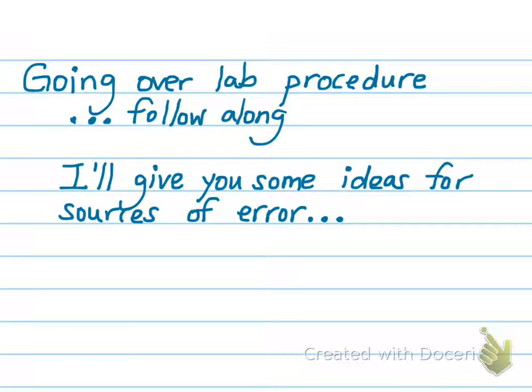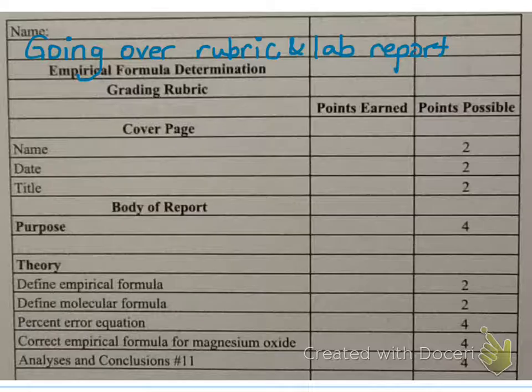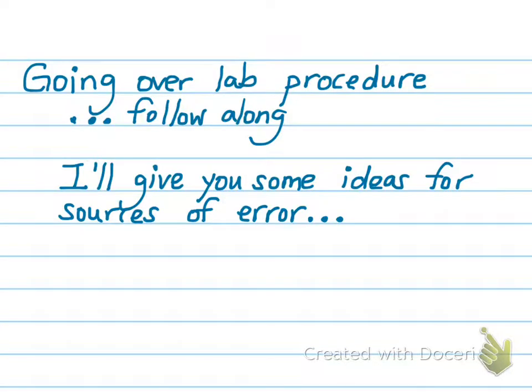For those of you who have asthma, if we were doing this in class, I would tell you to make sure you had your inhalers with you when you came to do this lab. Caution: always handle the crucible and crucible lid with crucible tongs as shown in figure 9.1, and return or dispose of all materials according to the instructions of your teacher. So, procedure. As you perform the experiment, record your data in data table 1. Okay, we'll look at that eventually.